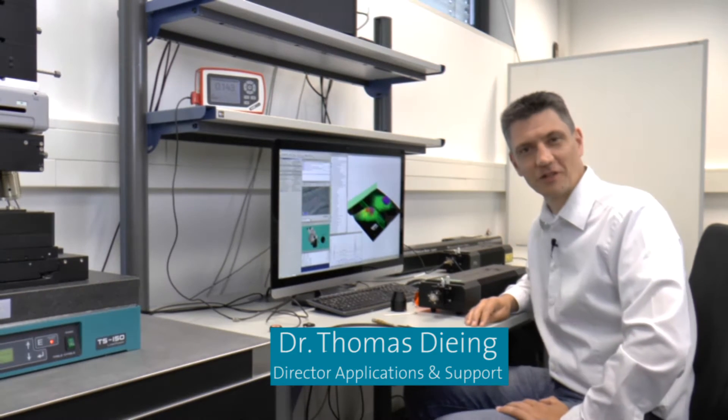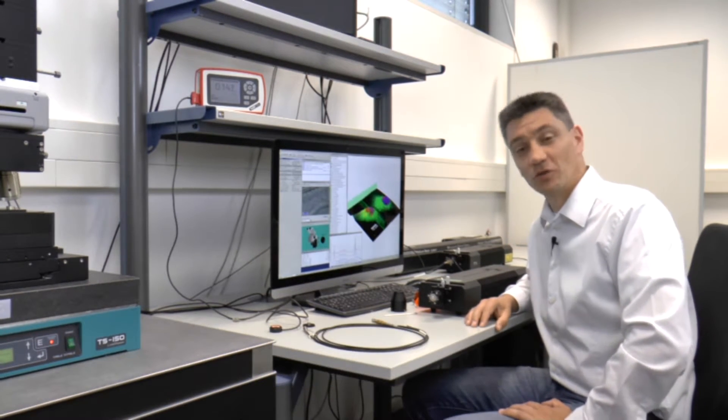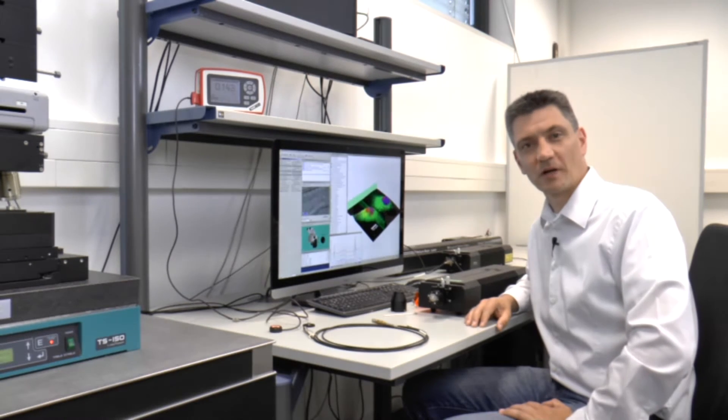Welcome ladies and gentlemen to the WITec applications lab. Today we present you a short movie about fiber coupling.